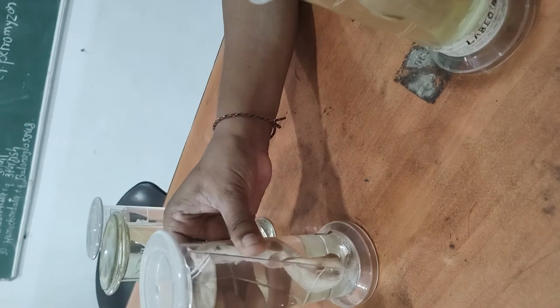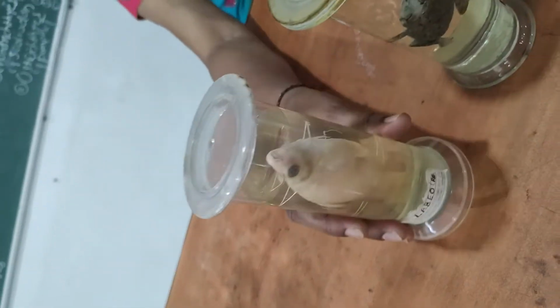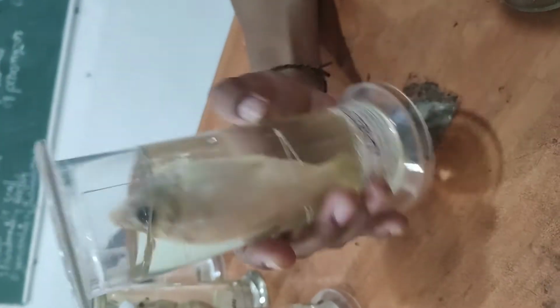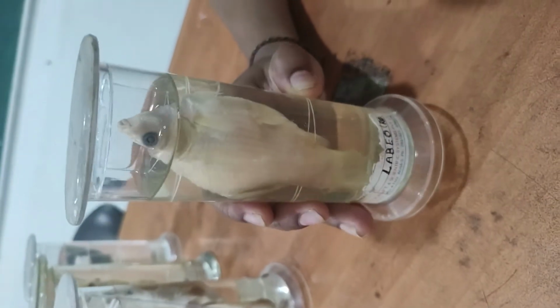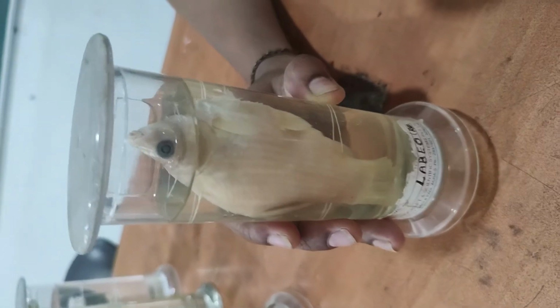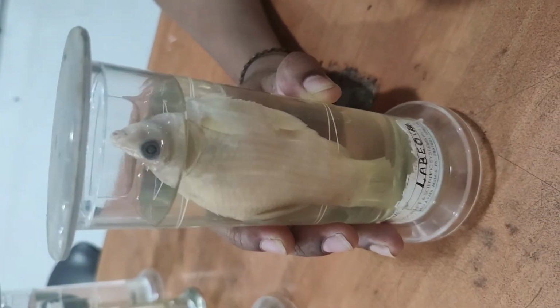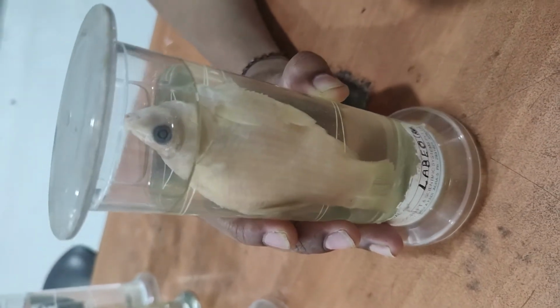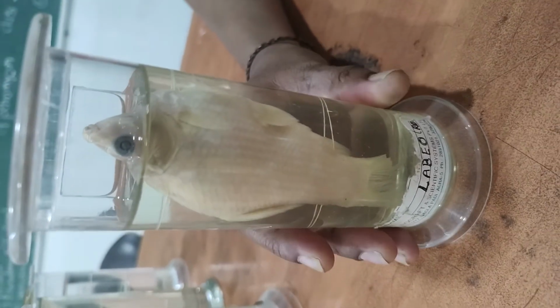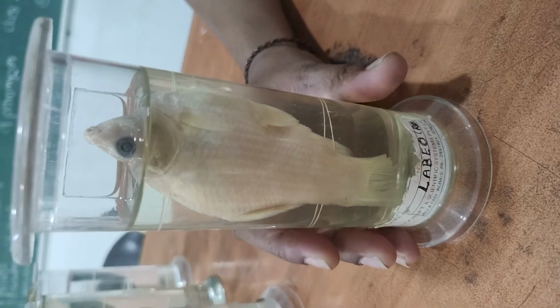Now we have another class under the superclass Pisces, and that is Osteichthyes. Example we have is Labeo rohita. These Osteichthyes are also aquatic, but they are found in freshwater as well as marine water. Their endoskeleton is bony, and that's why they are called Osteichthyes.